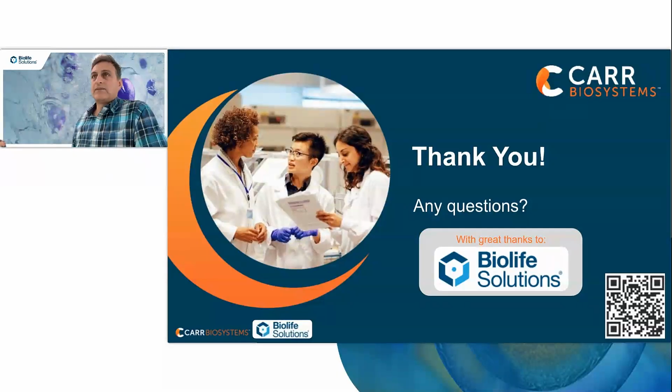In terms of additional considerations for hold time, in this study we had multiple parameters to look at. We focused on the variability from different donors, a couple of different wash methods, the wash buffers and elution buffers, as well as different formats of freezing the leukopak.